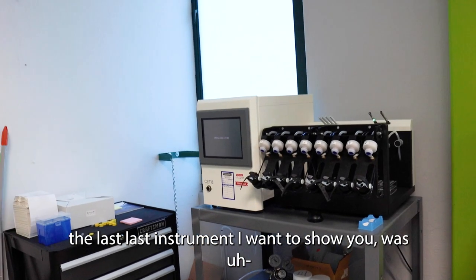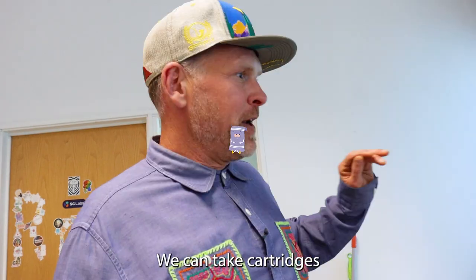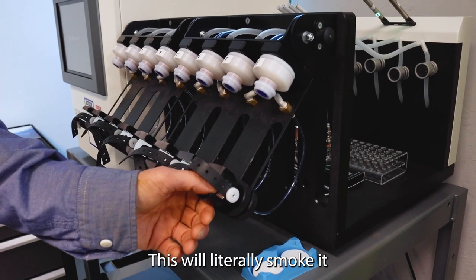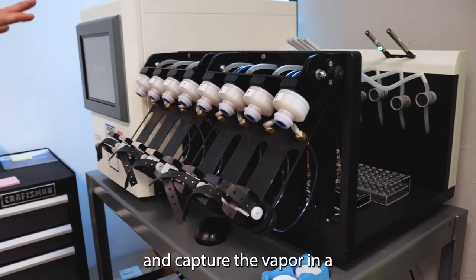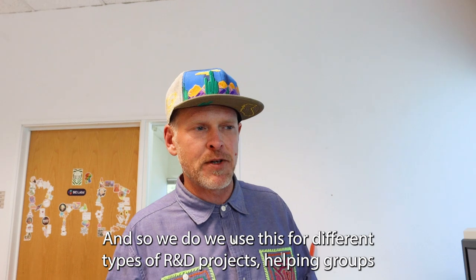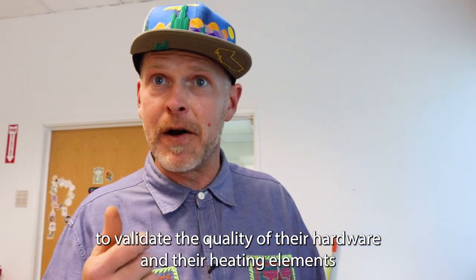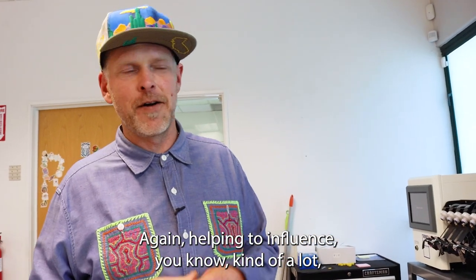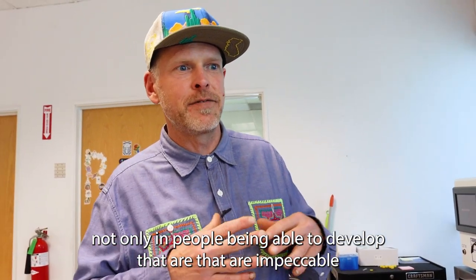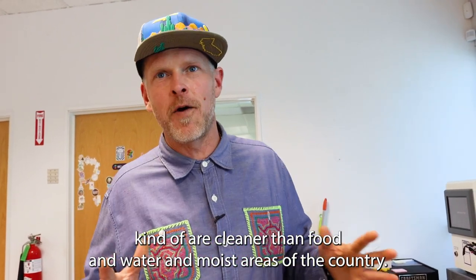The last instrument I want to show you is basically a smoking robot — I like to call it Towelie. We can take cartridges and load them into these artificial mouths. It will literally smoke the cartridge and capture the vapor, which we then run through the GC mass spec. We use this for R&D projects, helping groups validate the quality of their hardware and heating elements, and helping people develop products that are cleaner than food and water in most areas of the country.